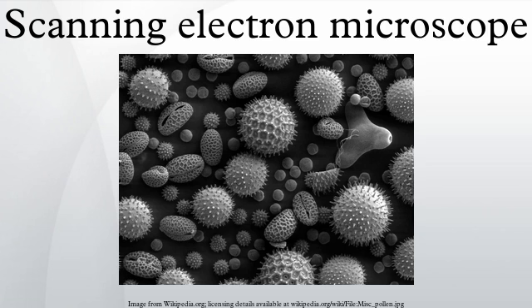If the SEM is equipped with a cold stage for cryomicroscopy, cryofixation may be used and low-temperature scanning electron microscopy performed on the cryogenically fixed specimens. Cryo-fixed specimens may be cryofractured under vacuum in a special apparatus to reveal internal structure, sputter-coated, and transferred onto the SEM cryo stage while still frozen. Low-temperature scanning electron microscopy is also applicable to the imaging of temperature-sensitive materials such as ice and fats.